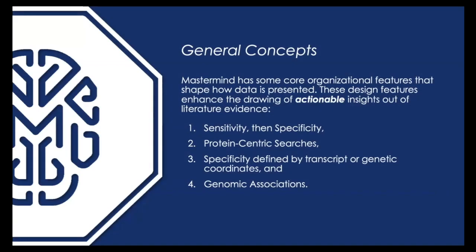So this tutorial is intended to accompany a companion quick start guide that was written with the intent to introduce researchers to Mastermind and to ensure that you get the most out of your data and time while using it. You will find this guide in the handout section.